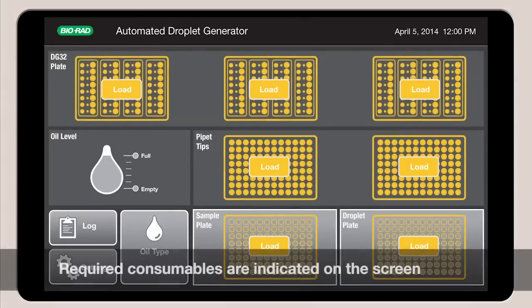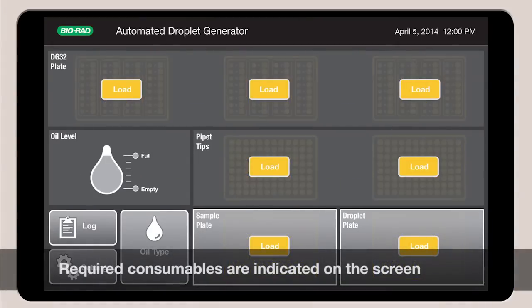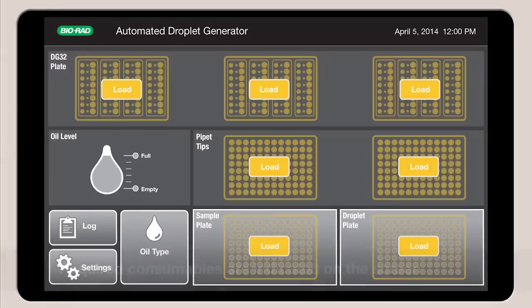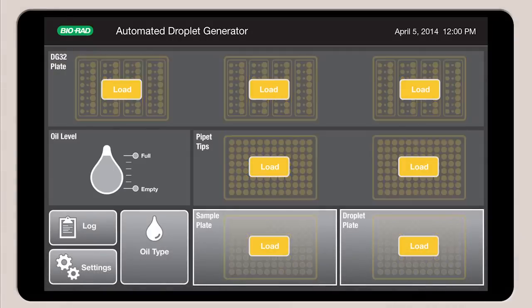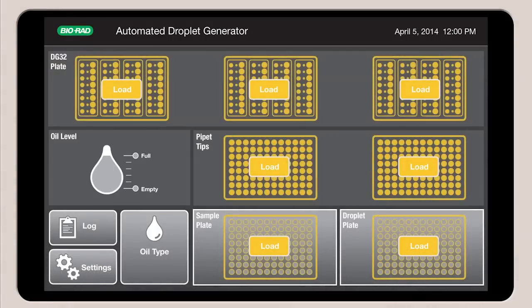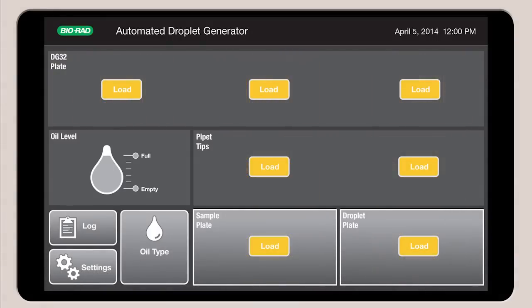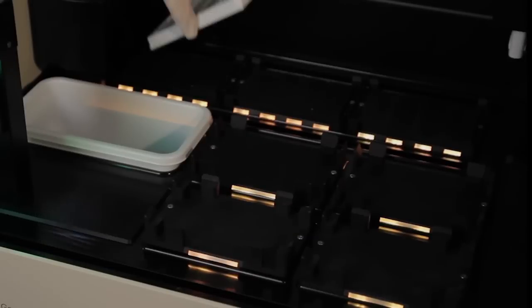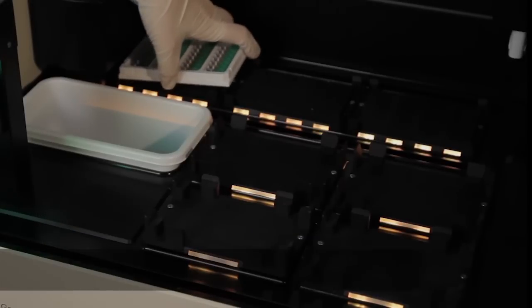The AutoDG calculates how many consumables are needed and indicates where to load them with blinking yellow icons on the touch screen. These correspond to yellow lights on the instrument deck.